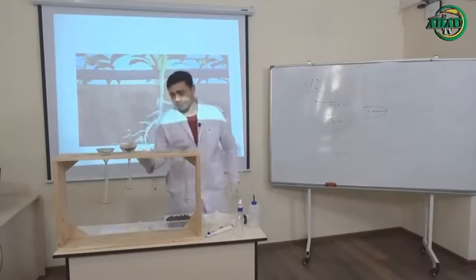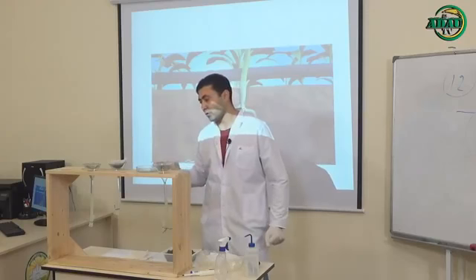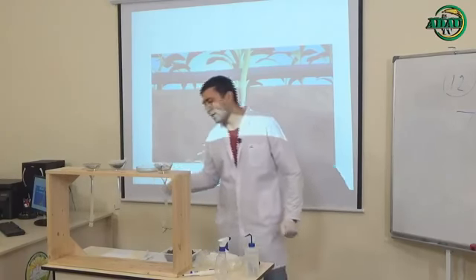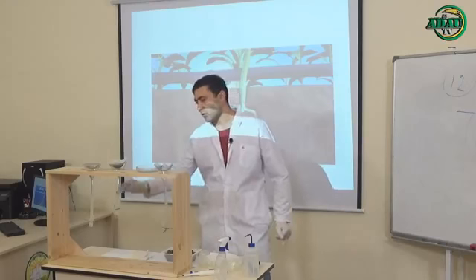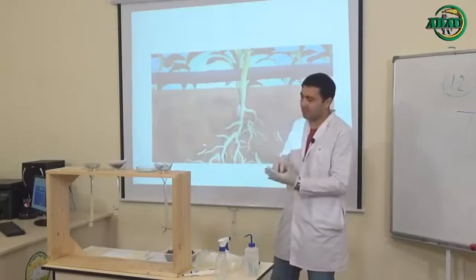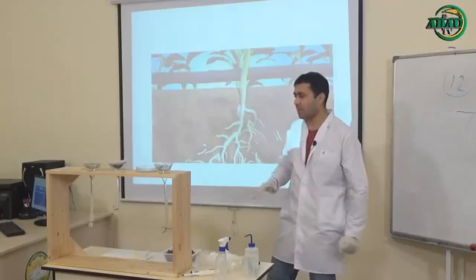Same as with soil, we have to wait more than 12 hours. It should also be more than 15 or 20 hours. Then the same processes will continue. All these nematodes, step by step, will come into the water. Then we take this water and put it in dishes for observing under the microscope.